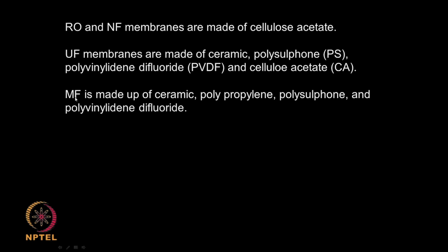If you come to microfiltration, it is made up of ceramic, polypropylene, polysulfone, again PVDF type of material. Again you can have hydrophilic and hydrophobic type of material. These are synthetic polymers, and these are inorganic material. So, some of these materials can take up very high temperature, some of these materials like cellulose cannot take up very high temperature. Okay.